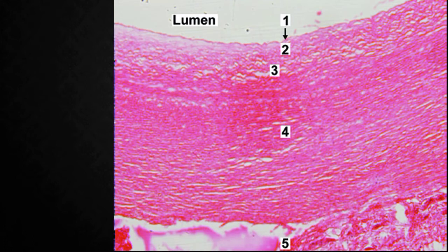There are the elastic artery, that is the large size artery, large size vein, medium size artery, and medium size vein. So the first thing is the large size artery or elastic artery. The large size artery identification is very easy because only a small part of the artery can be focused in the 10x. So in the 10x we can identify clearly the endothelium layer in the tunica intima, then subendothelial connective tissue, then the tunica media consisting of an abundant amount of elastic fibers. All these elastic fibers can be seen.